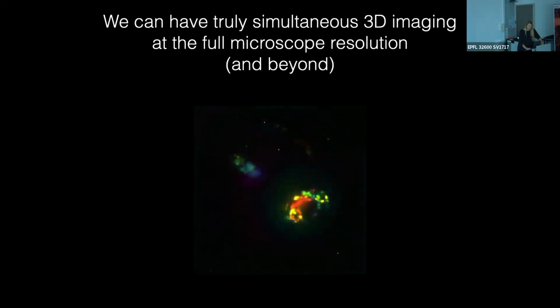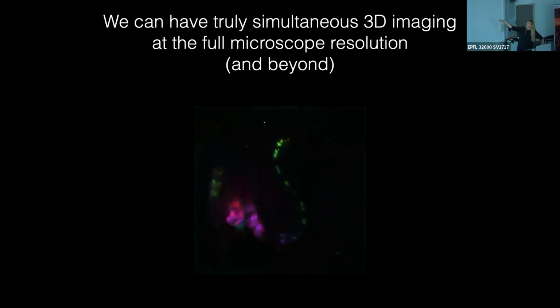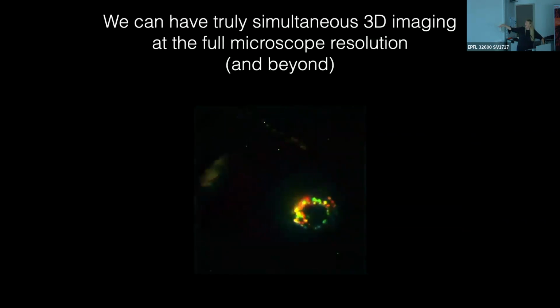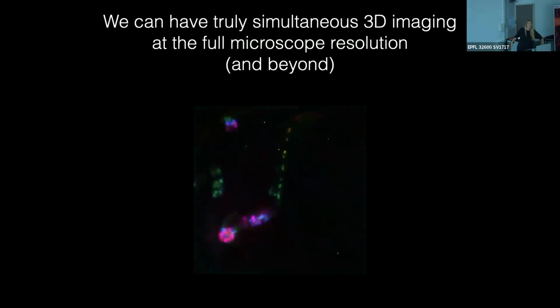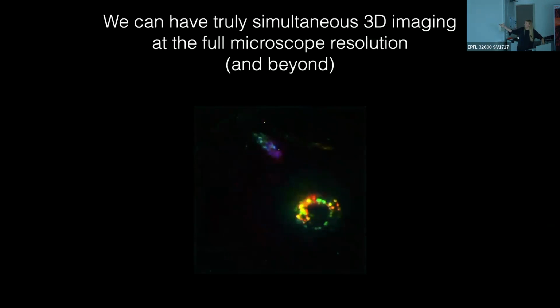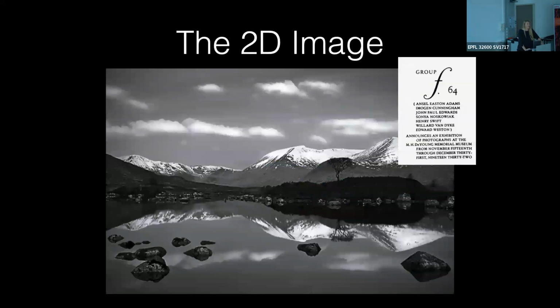And here's more 3D data. So this is truly 3D, simultaneous 3D imaging at full resolution of the optical microscope. These are two freely moving C. elegans animals. They have panneuronal expression of GCaMP. The color is just the Z projection because it's really hard to do these 3D visualizations. When we get better at that, our talks will be much better. So this is coded in depth with Z. So 3D imaging, I would argue it is really, really cool.